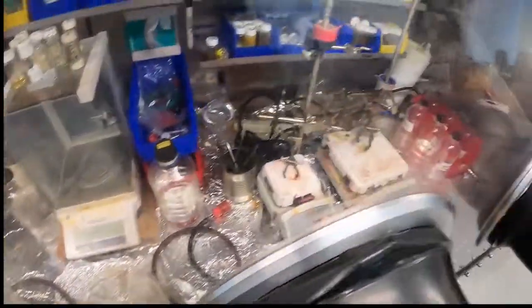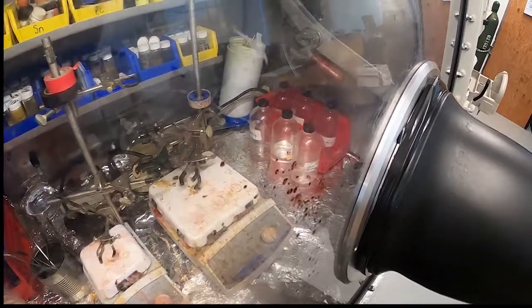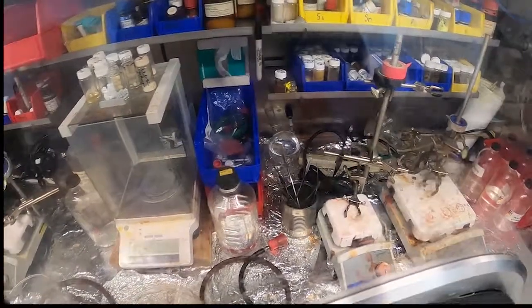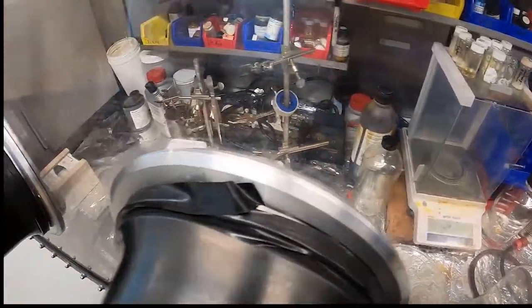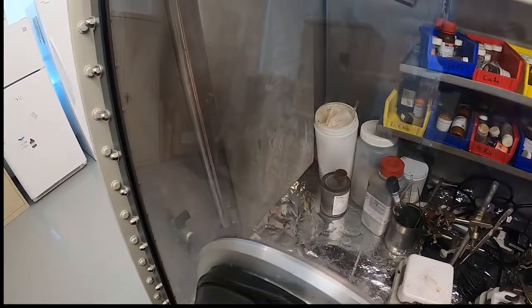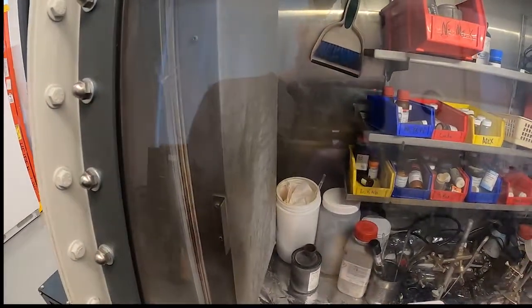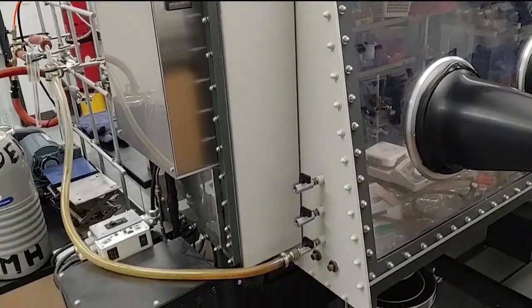We have our balance. We have various solvents that are kept in bottles that are tightly closed, as well as some in Schlenk flasks with Teflon stoppers, and various other things as well. Ours also has a freezer so that we can store things that need to be kept cold. Our freezer is currently operating at minus 30 degrees.